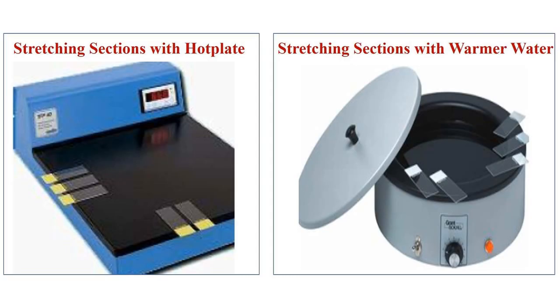And this slide shows stretching sections with a hotplate or warm water to make them easy to stain and examine under the microscope.